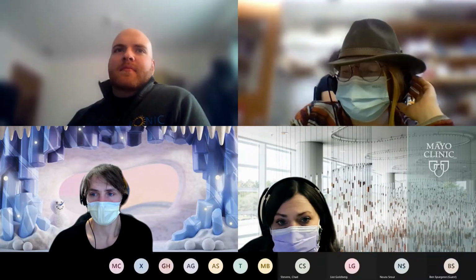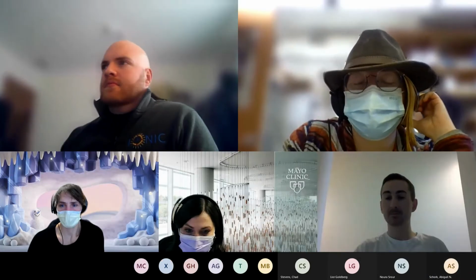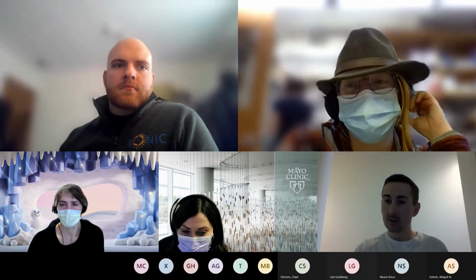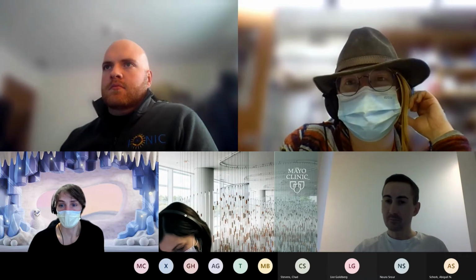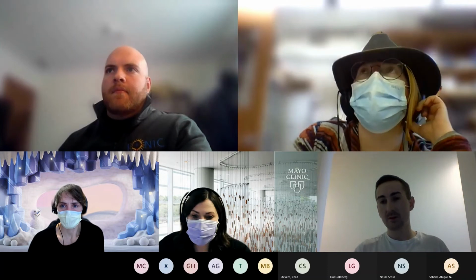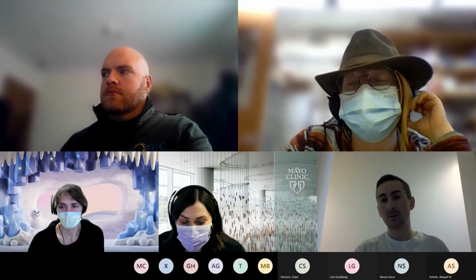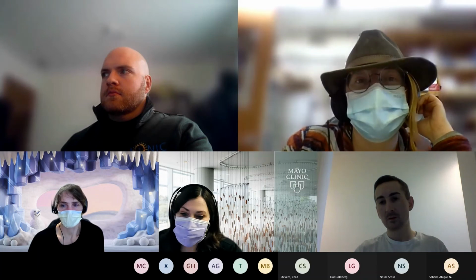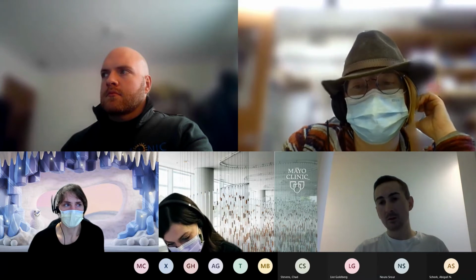Hi, Ben. I had a quick question. When you have the variation in your sample prep, is it post-staining, pre-staining, or both? I'm wondering if you could use a little bit of DMSO, because normally for freeze-thaw we store cells with a little DMSO to help with that transition. You had also mentioned potentially storing some of the antibody cocktails with some DMSO to keep them stable, so maybe you could keep a little DMSO in.